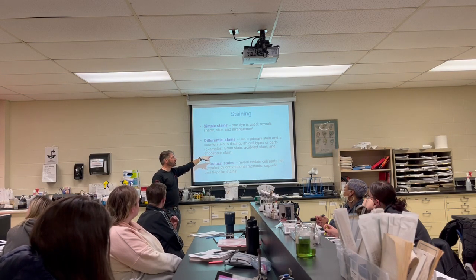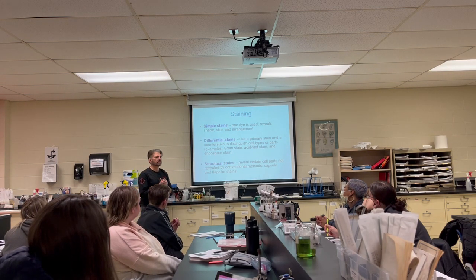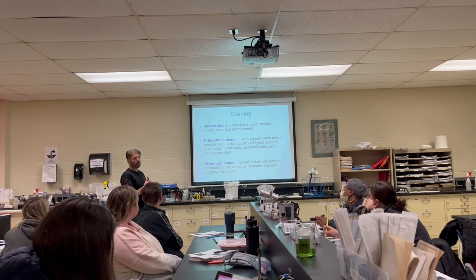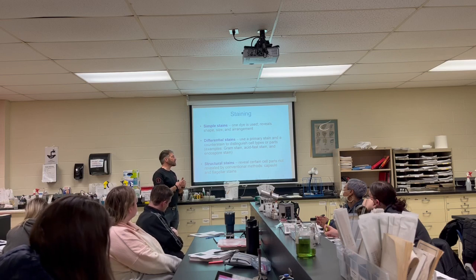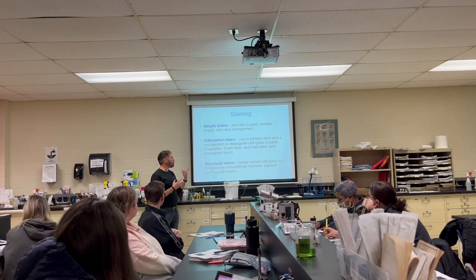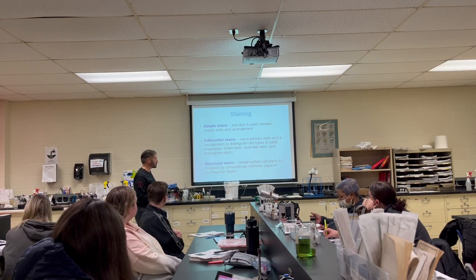Absolutely. Now, what if something's acid fast? What does that sound like? I don't know, but it sounds like it's probably harder to kill. Right? So we're looking at, like, you guys heard of tuberculosis? So it's got a very waxy coat. It's acid fast. So if we're staining something and we say, well, you know what, it wouldn't gram stain, and even the acid stain wouldn't work, but I was able to stain it with endospore stain. Right? They'll tell us what it is and how we would treat it.